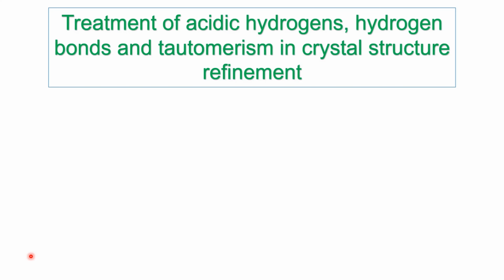Hello everyone, welcome to this video tutorial on treatment of acidic hydrogens, hydrogen bonds and tautomerism in crystal structure refinement.